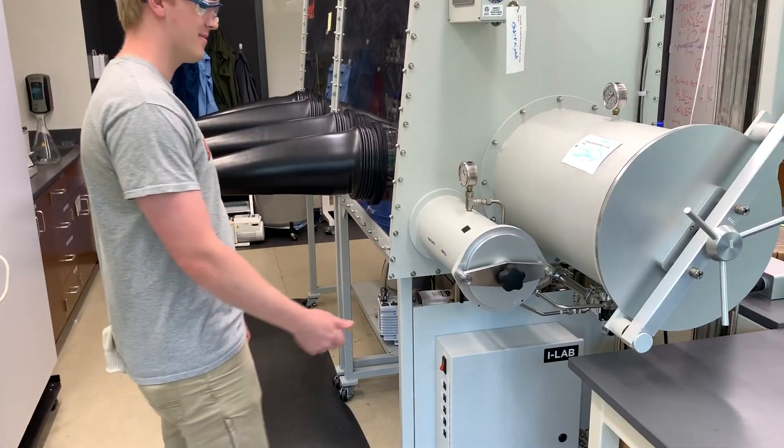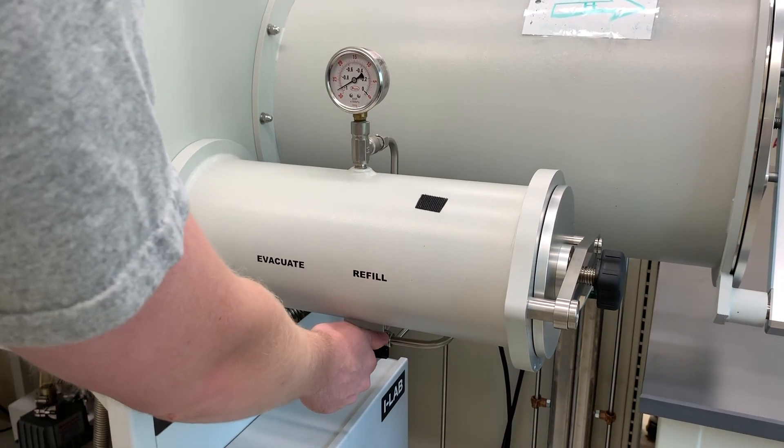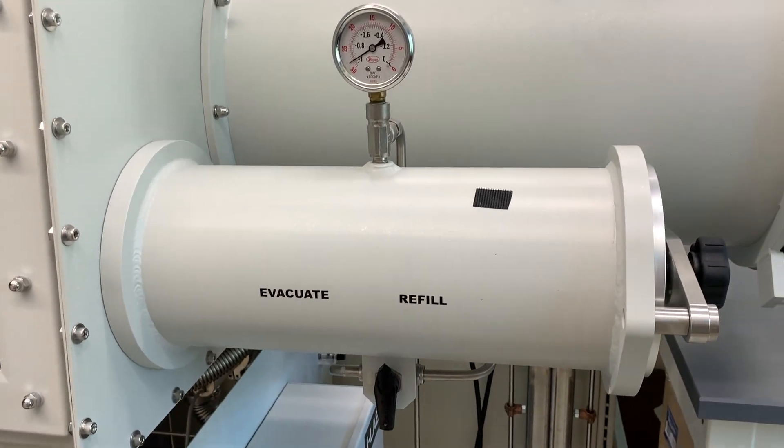Once you've brought in your materials, close up the antechamber and turn the doorknob clockwise until it's firm but not too tight. Then evacuate the chamber to make sure the doors are sealed properly before moving the knob back to the neutral position. The cycle is complete!